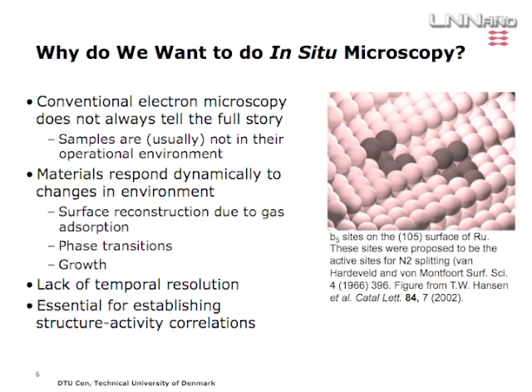The image over here is, of course, a model. The sites you see indicated here are also called B5 sites, which are believed to be the active sites for nitrogen decomposition for ammonia synthesis. This threefold hollow site and the bridge site you have up here. The dinitrogen molecule can adsorb here and be decomposed into two nitrogen atoms, which can then combine with hydrogen and form ammonia.